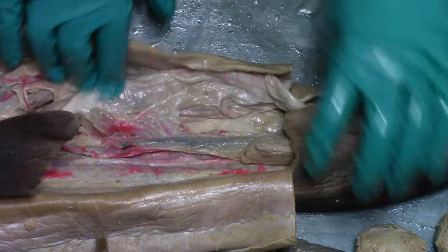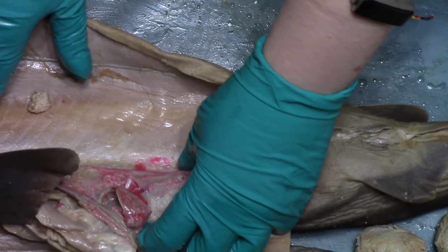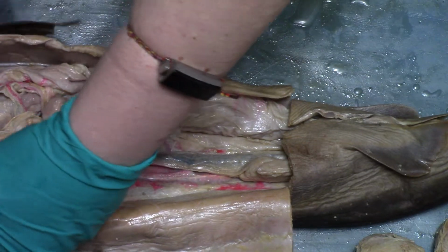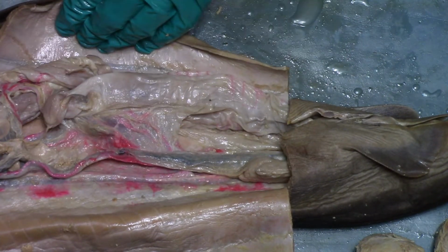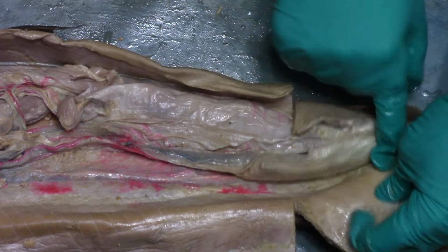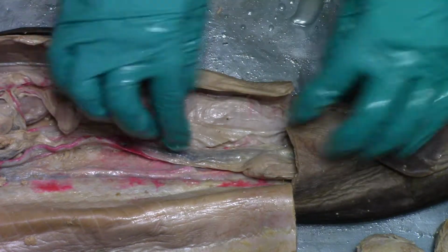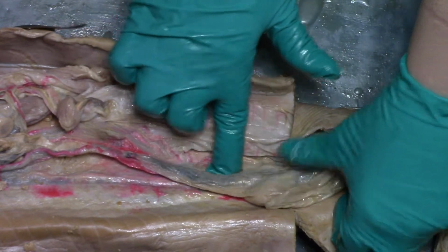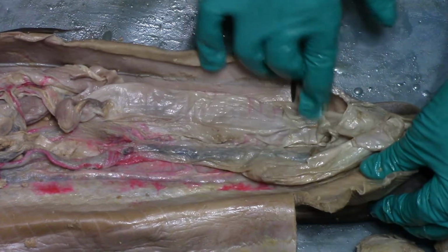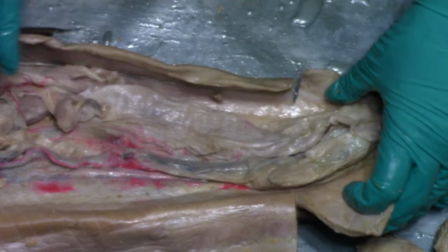So that was on one side of the shark. From at the top, those eggs, so we had the egg yolks without sharks, and we worked our way down until we found full sharks. And if we go to the other side, I already pulled some eggs off of this side, and we can follow that canal and look. Here's another shark. Can you see it? Like, oh, my glove isn't fitting very well. Can you see that shark inside that uterus right there? And there's its egg sac. So it's got the dual canals, so sort of like one vagina and then two uterine canals leading up to two egg chambers.